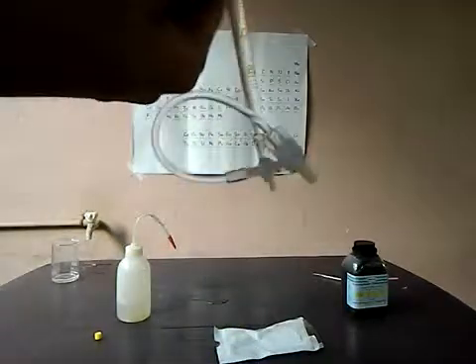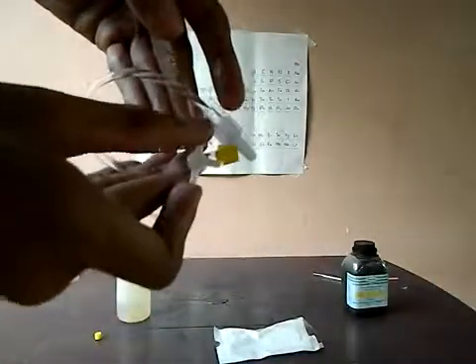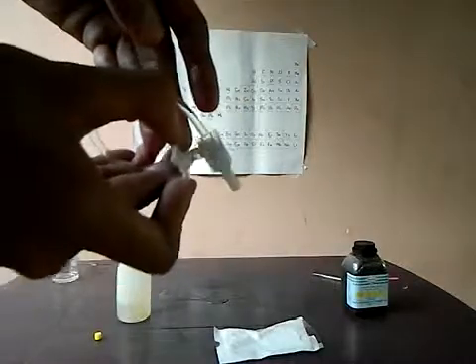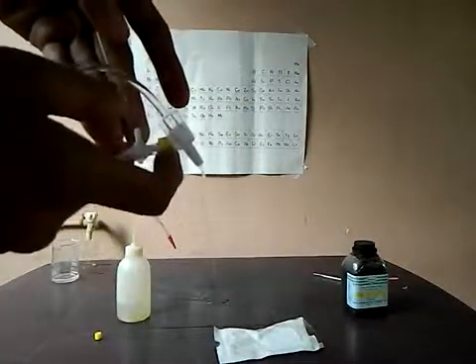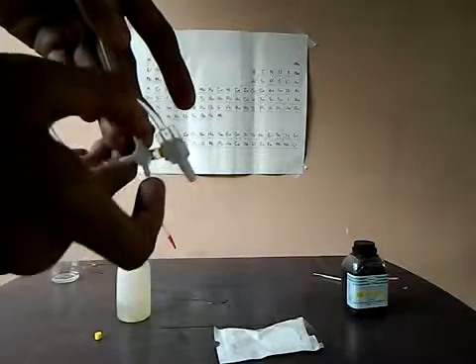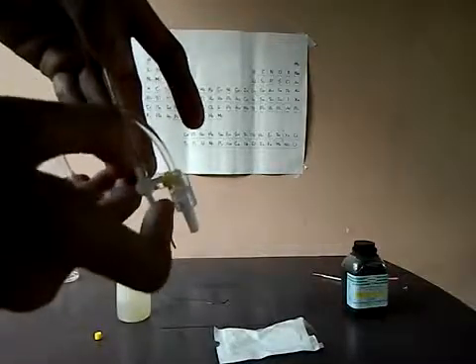And now here is the stopcock — you can see that. I don't have a stand, so I just turn this thing around like that, over here, and the water starts — you can see. And if you want to stop, you turn it again, right like that. And this works as a stopcock.